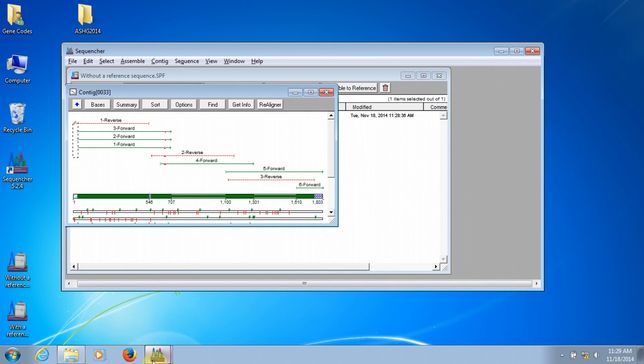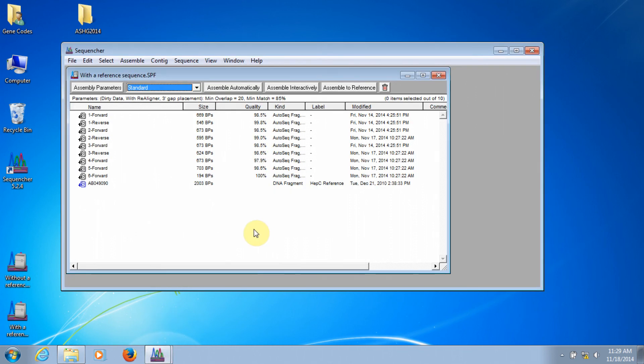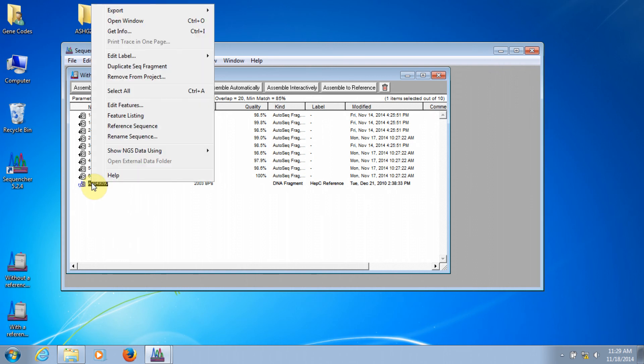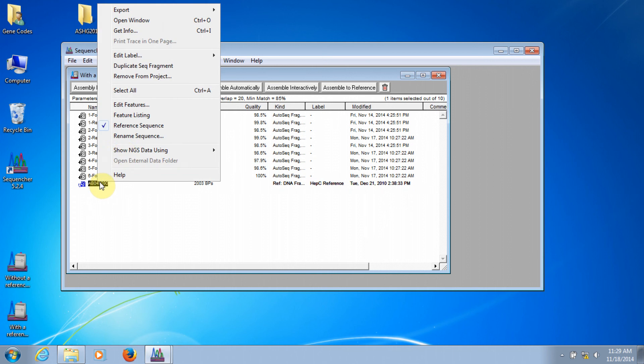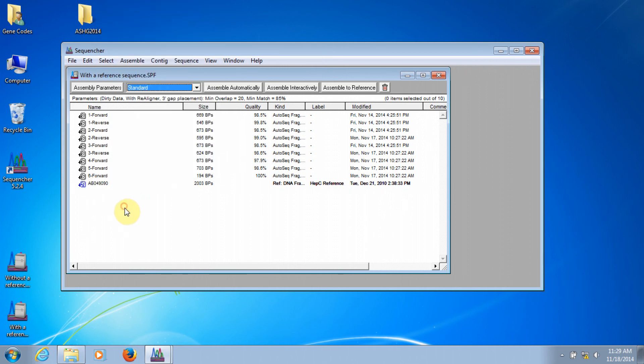If you are assembling to a reference sequence, the process is just a little bit different. In this case, I begin by right-clicking on the reference sequence and making sure that there's a check mark next to reference sequence in that menu. You can tell if your sequence has been designated as a reference sequence because on its icon, there will be this little capital R, and when you right-click on it, there will be a check mark next to reference sequence.